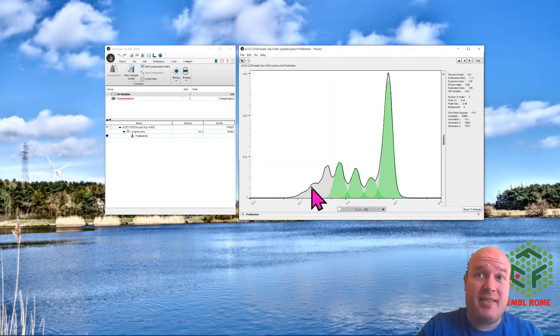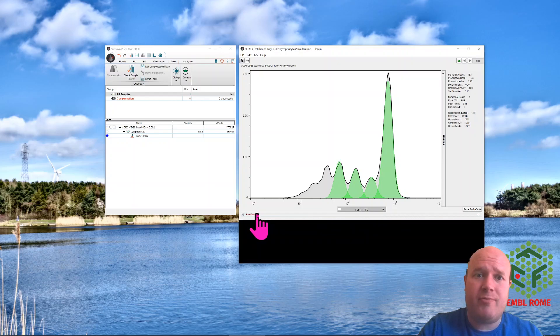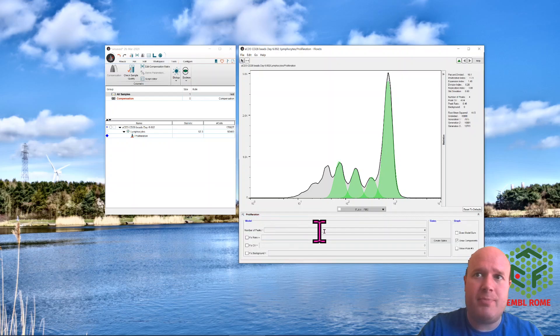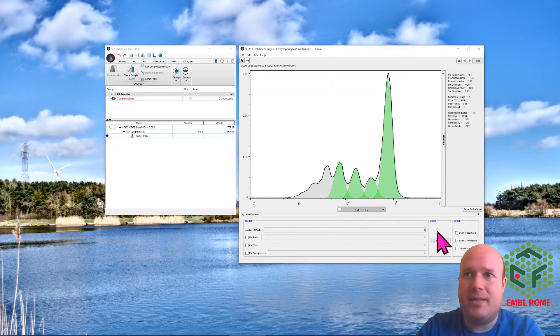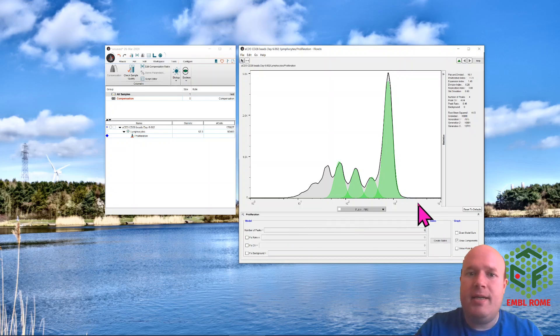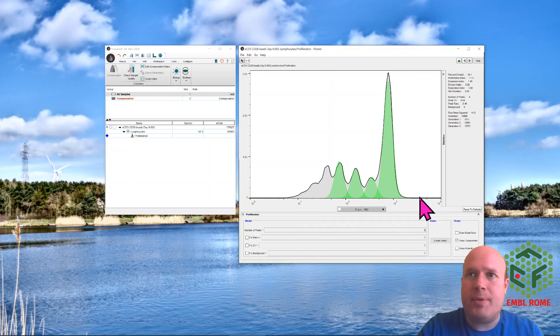I think there's six peaks. So if I click on the proliferation tab at the bottom, I can change some of the parameters and I can type in six. And again, this is going to take about ten seconds to do the calculations.